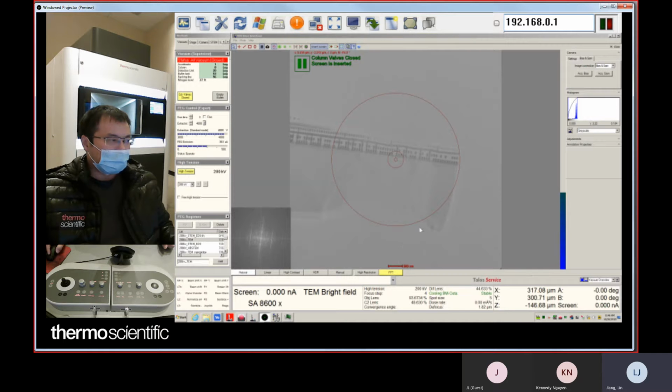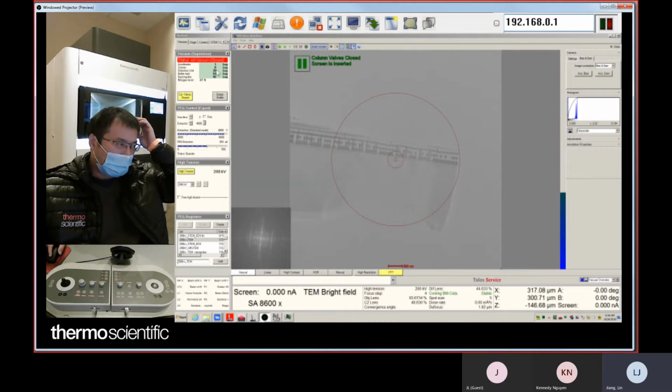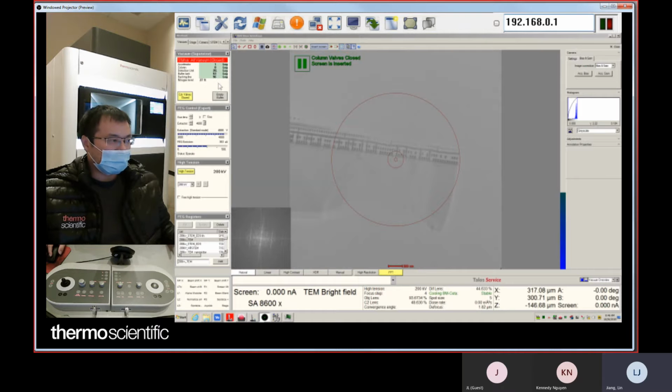Because adding liquid nitrogen makes a cold trap piece, it's definitely going to help you lower the vacuum further. It's a cold metal piece put into your column, so it attracts molecules, which helps improve your vacuum. It also helps trap and absorb organic vapor, which lowers the contamination in your column.